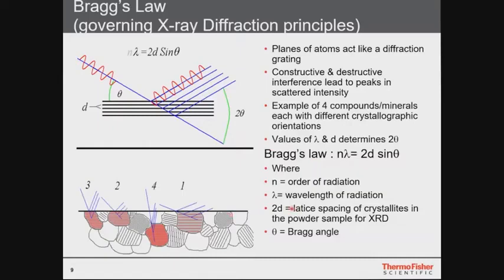And this d value here is the distance between these atomic planes. You can also see it here. It really depends on which type of material you are investigating.